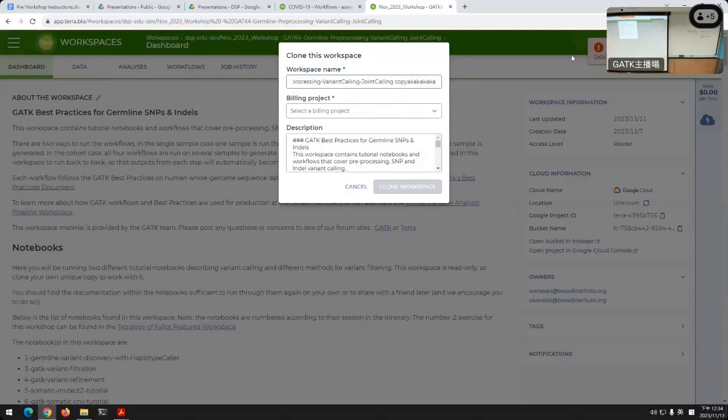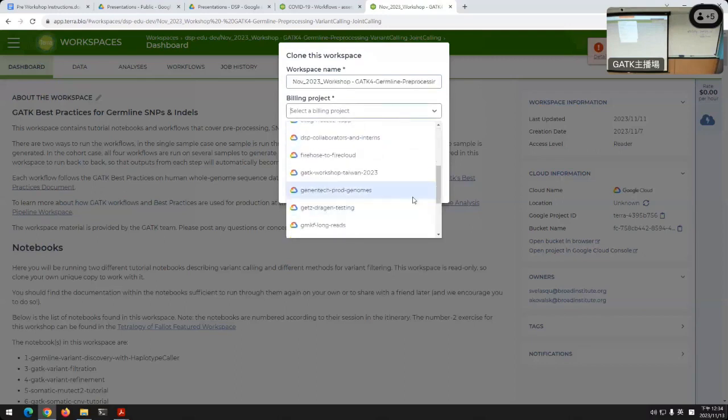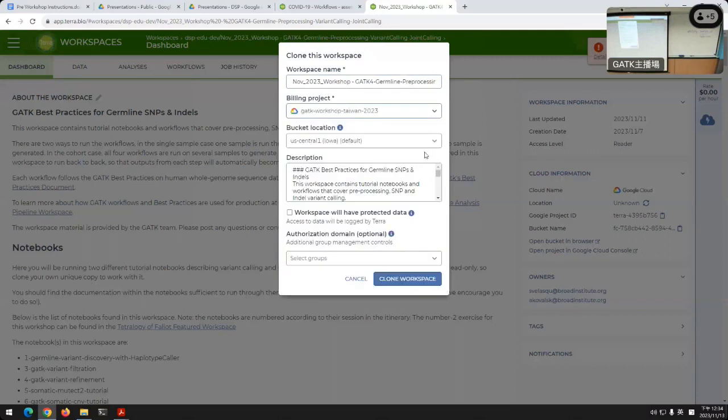Right, and I'm going to go ahead and select. So that's what I'm going to do. I'm not going to modify anything else, and we don't need to. I don't know if bucket regionality is important to everyone here, but you can change your bucket location if you need.